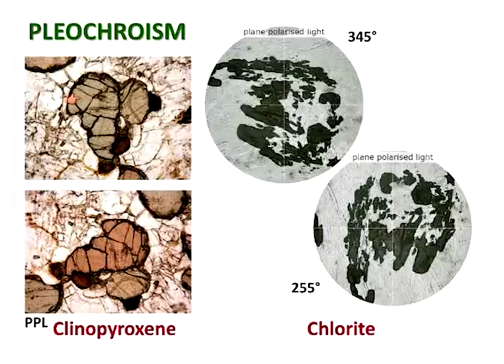So on the right hand side I thought I'd show you something which is even more subtle, which is chlorite. So in fact in this slide I'm not even sure what this high relief mineral is. It could be an amphibole possibly, but ignore that if you can and look at the ground mass. Now this looks kind of bluish, but chlorite is sort of advertised, if you like, as pale green. But what I hope you can see, the only reason I put this up really, it doesn't matter what colour you see, but I hope you can see the change in colour from this orientation at the top in the ground mass, particularly in the area I'm pointing to in the lower panel.